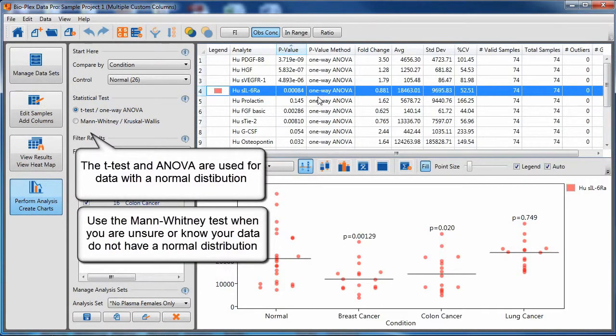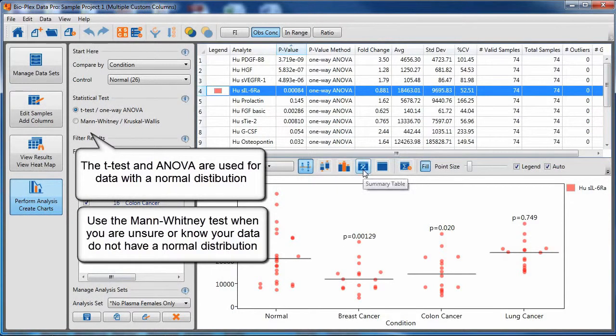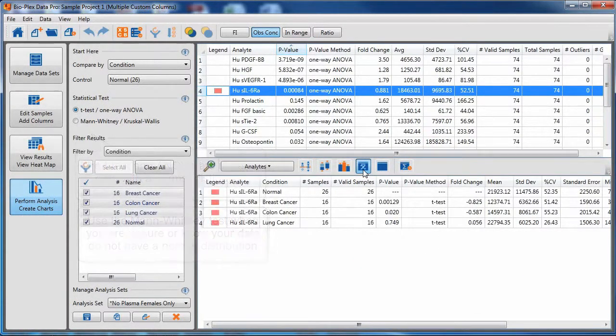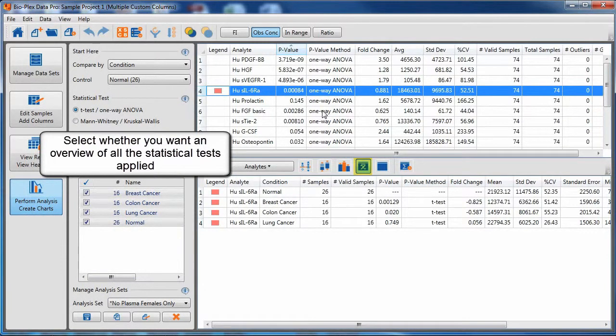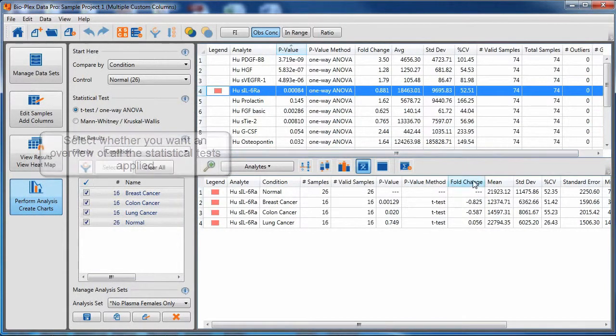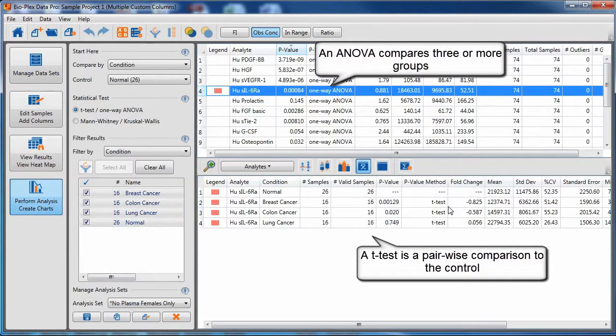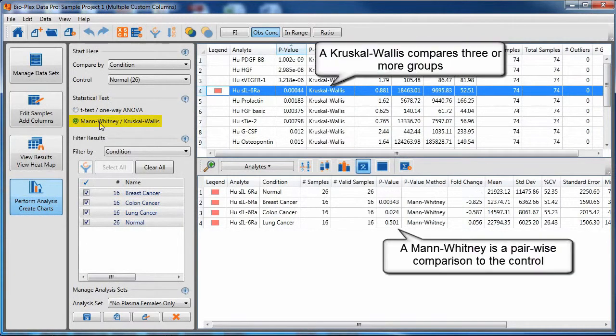T-tests and ANOVA are for data that has a normal distribution. Mann-Whitney is for data that does not have a normal distribution. ANOVA compares three or more groups. T-test does a pairwise comparison of the control to the other biological replicate groups.